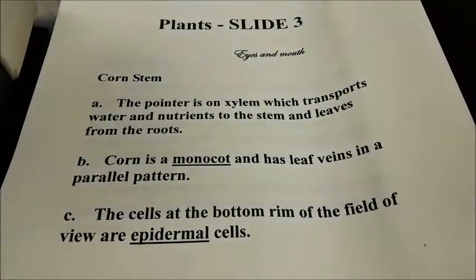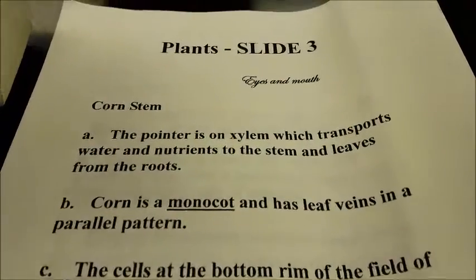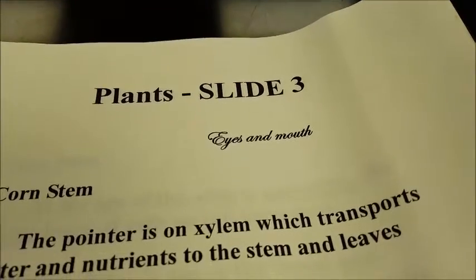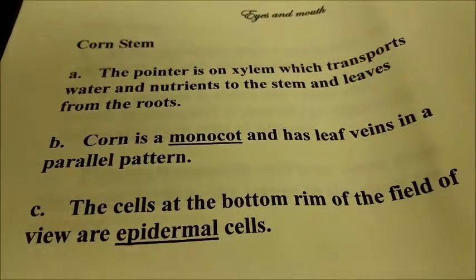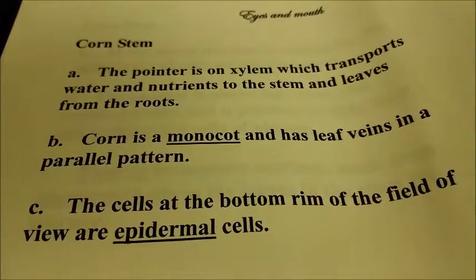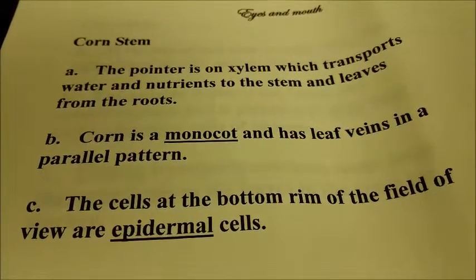In this corn stem slide, we are looking specifically at the xylem and the phloem. The pointer is on xylem, which transports water and nutrients to the stem and leaves from the roots.